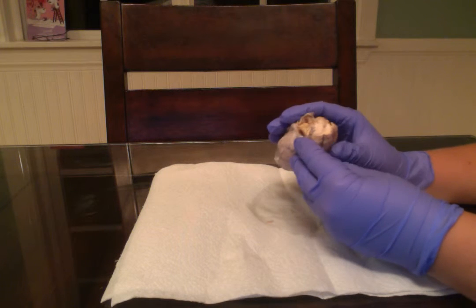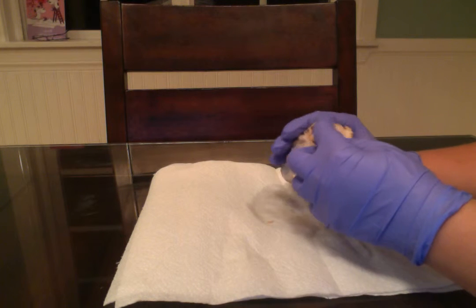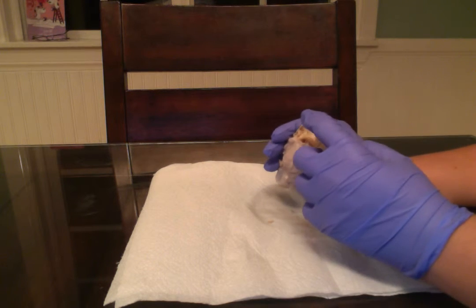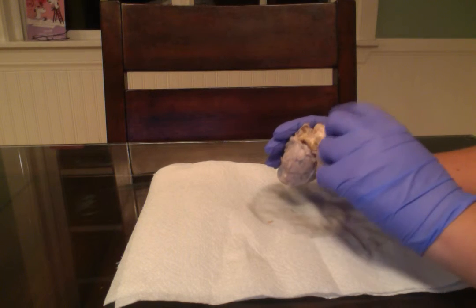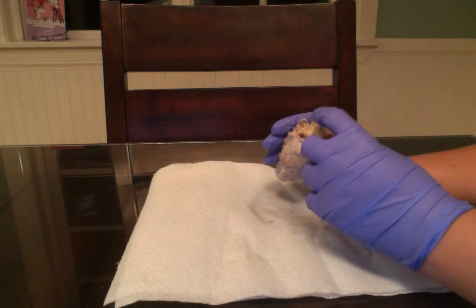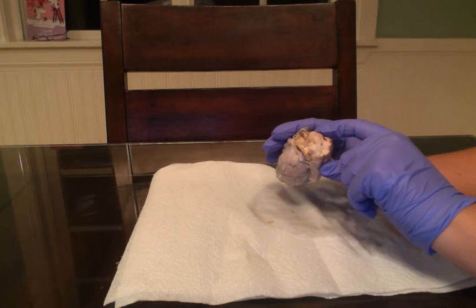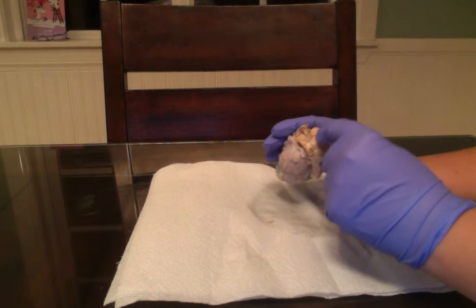We're going to look at the corpora quadrigemina. So that's going to be here. And the corpora quadrigemina of the tectum has the left and right superior colliculi. So we have the left and the right superior colliculi. We also have the left and the right inferior colliculi. We also have the pineal gland, which is going to be here.